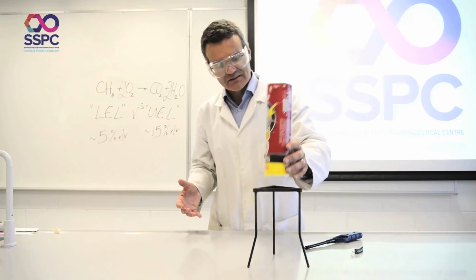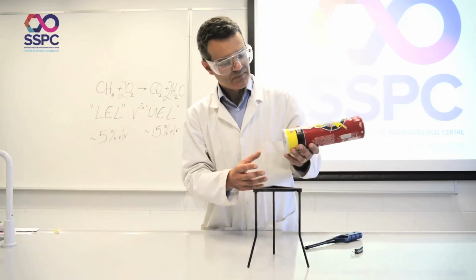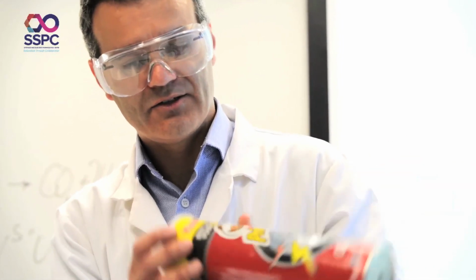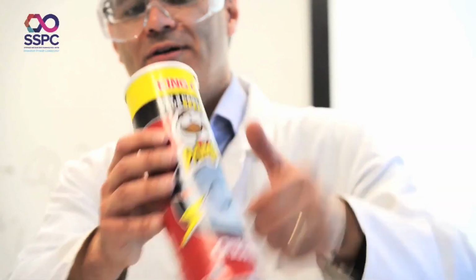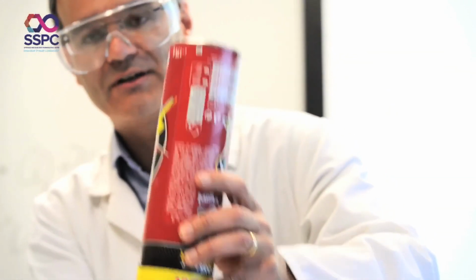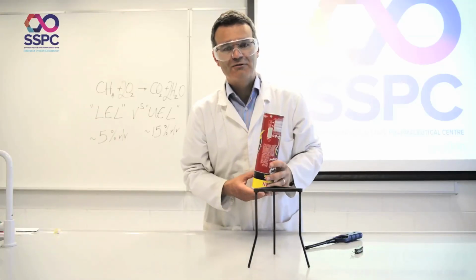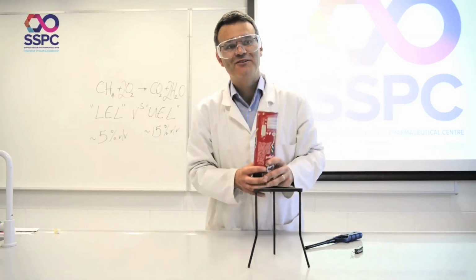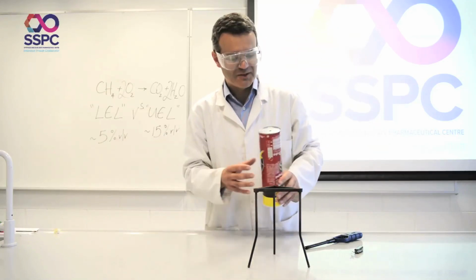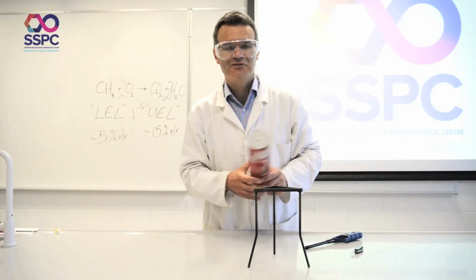Just the important things to note: be sure to take the parafilm off if you're using it, and certainly don't light it with the plastic lid up, because the plastic lid will burn. Lid down, and then when it explodes, it just pops up, and just be ready to catch it. And if you really want to go for it, use hydrogen and put the Pringles tube in it, but just put a tray around it. You get a much bigger bang, and the metal here will bulge as well. Yeah. So that's it. Thank you.